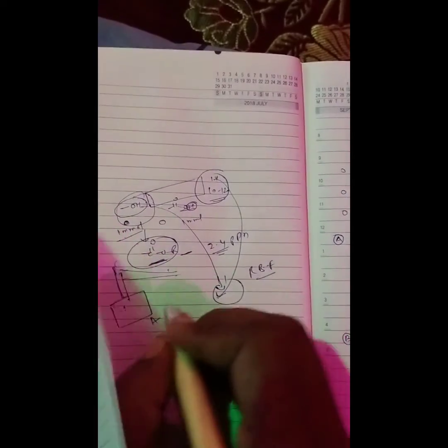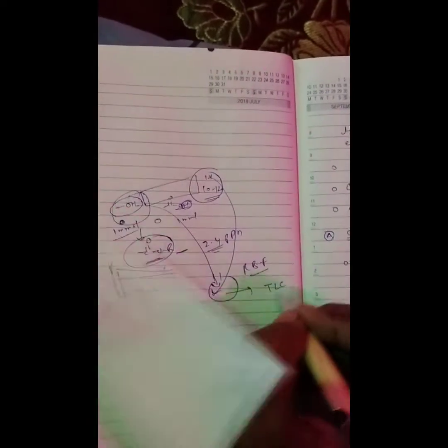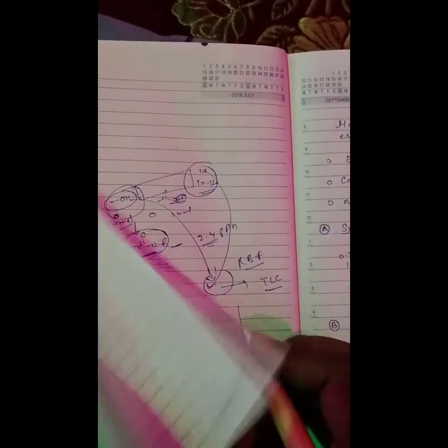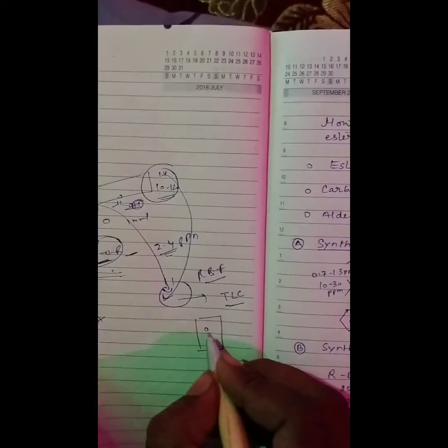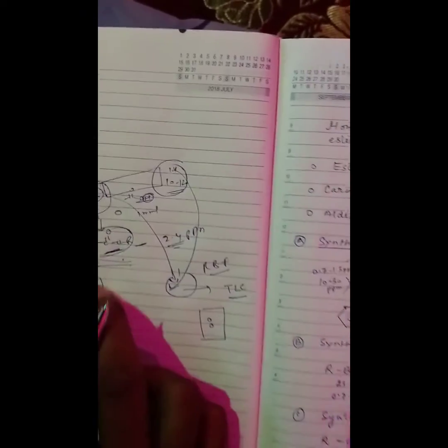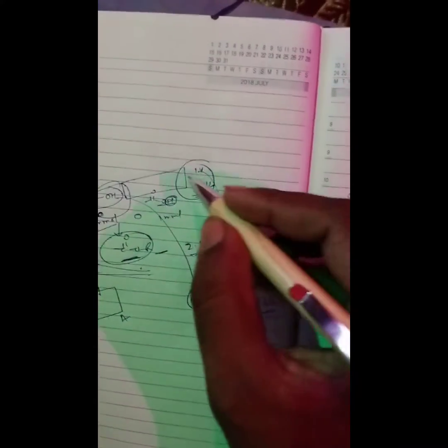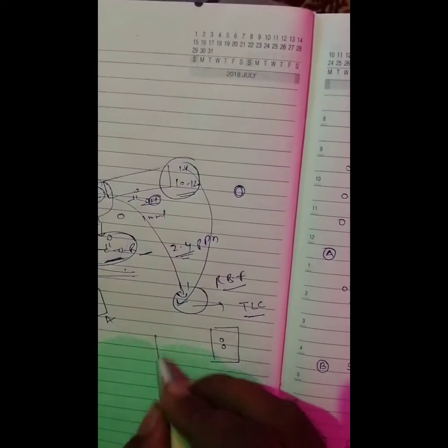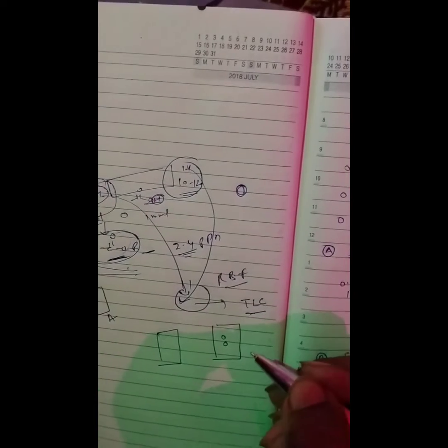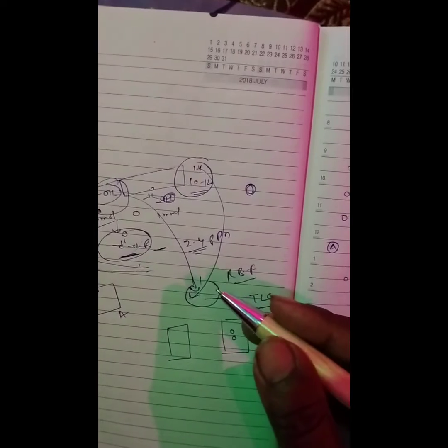After synthesis, the starting materials will be consumed, and you will take the TLC of this mixture. Before conducting the reaction, you will take some mixture of the starting materials, in which two compounds are present, the alcohol OH and the acid. So you will check after 1 or 2 hours, depending on the literature, on how much time the reaction takes for completion.